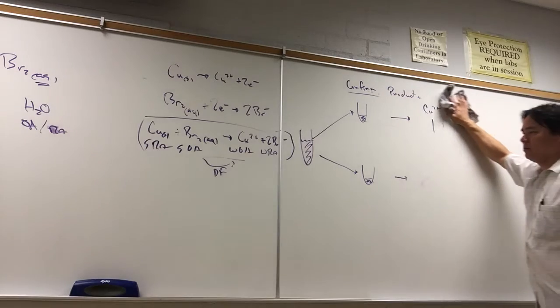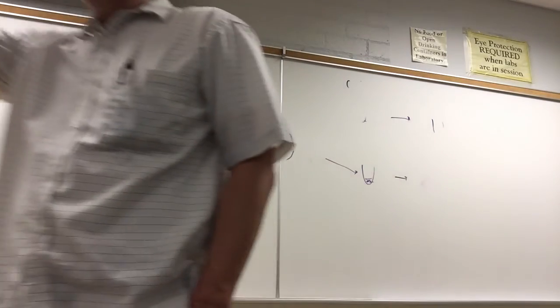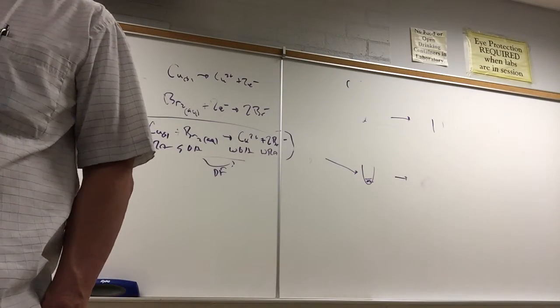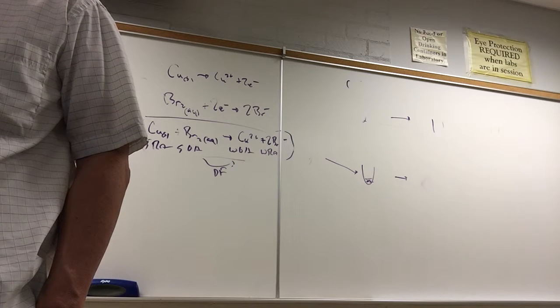Next, you're going to work on these. Since some people are pretty much done with experiment 17, and some people are still working on experiment 17, I'm going to delay the demo here. I want the people not to waste time and start with the 18 reactions, and then we're going to stop.